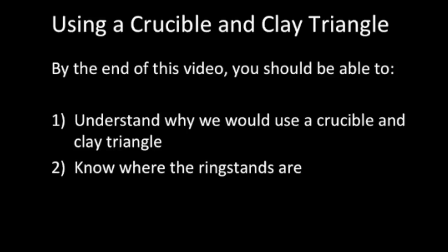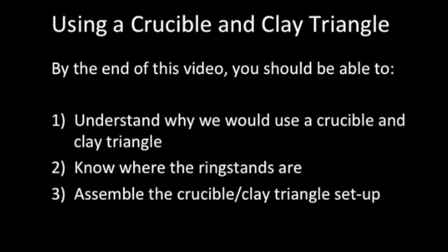Know where the ring stands are, and know how to assemble the crucible clay triangle setup.